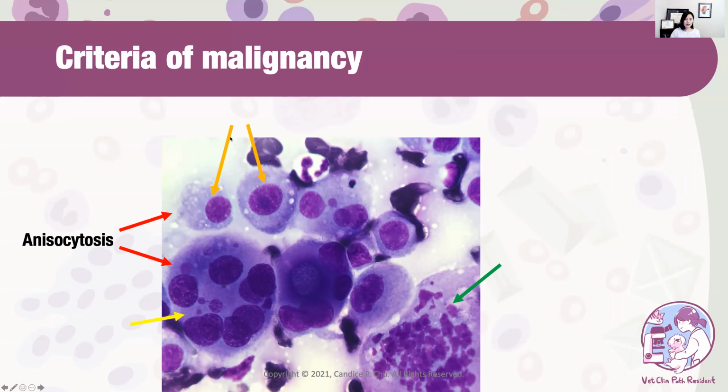And then focusing on these orange arrows, you see that they point toward the nucleus of two different cells, and there's some size variation among the nuclei. That's called anisokaryosis. And if you focus on this giant cell, it has many structures inside the cell. How would you describe what's going on? Yes, that's multinucleation.